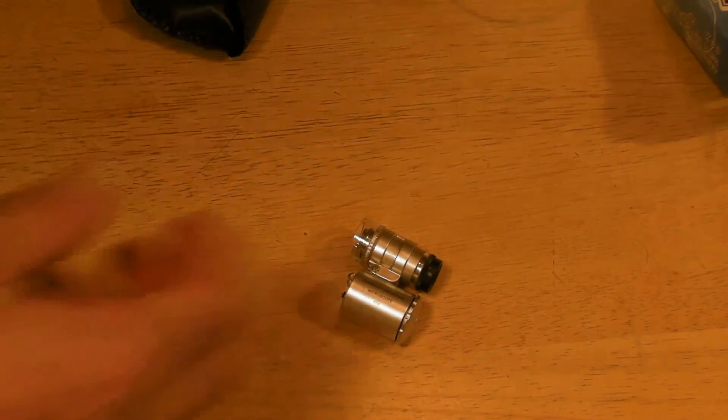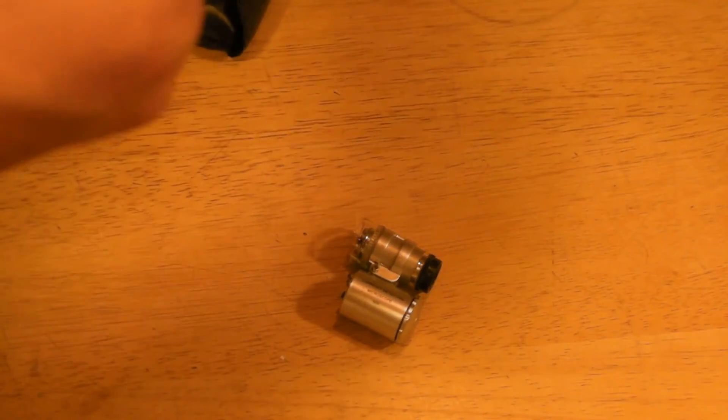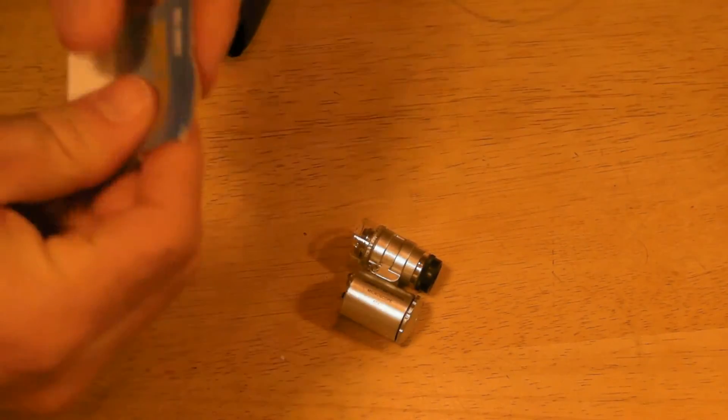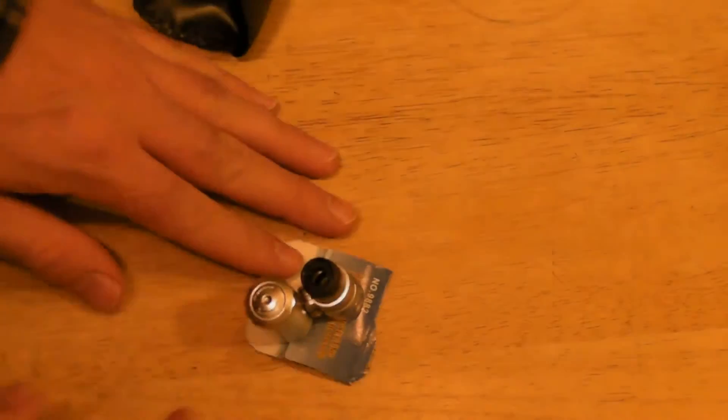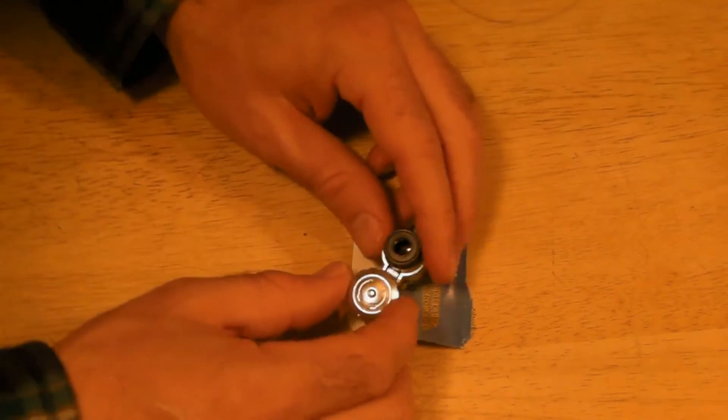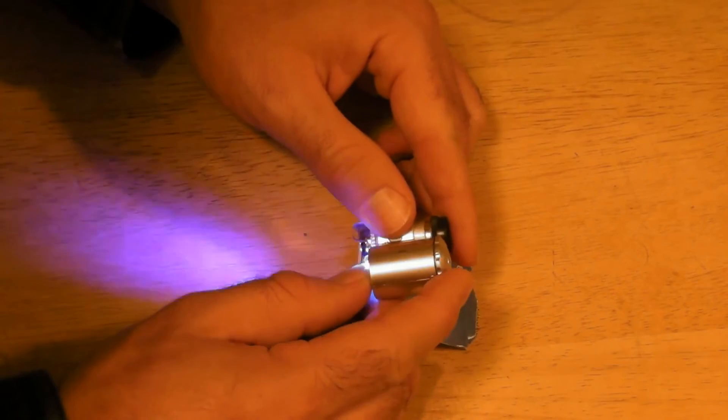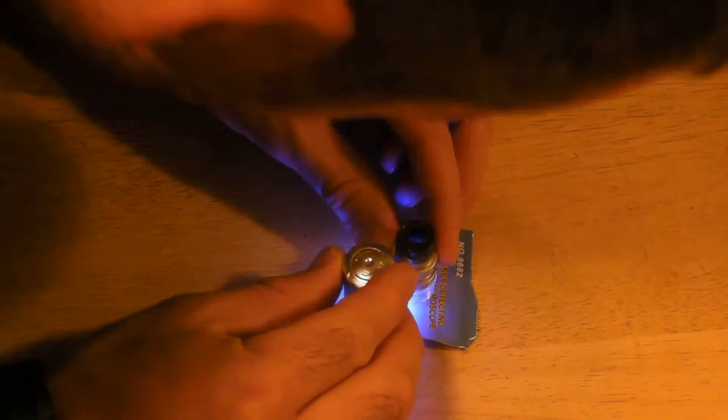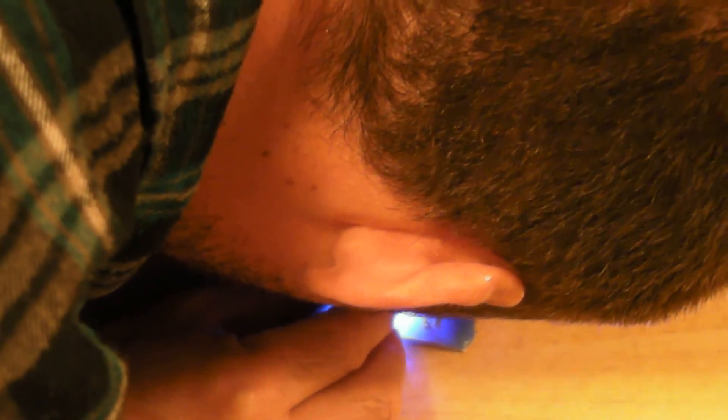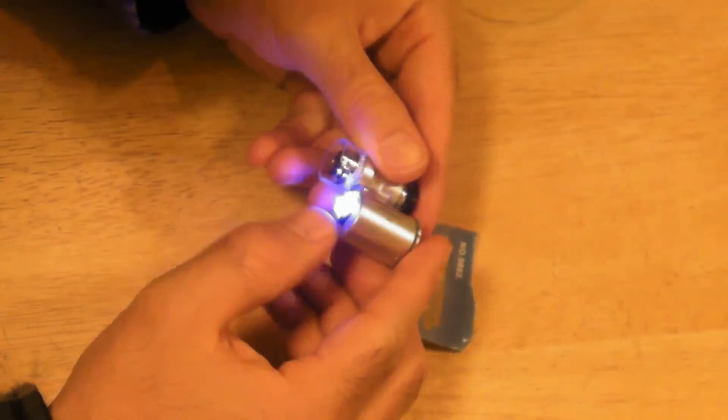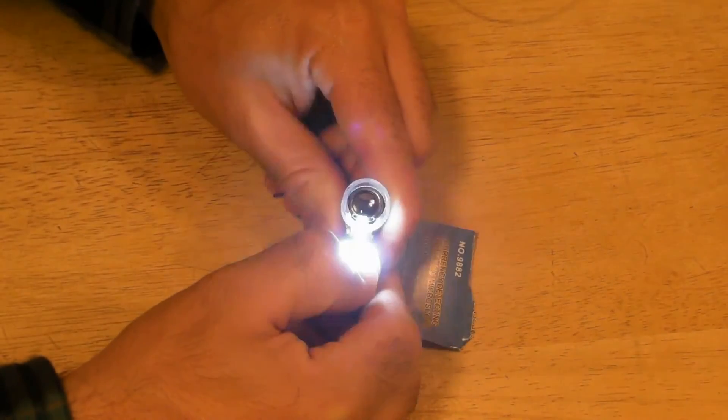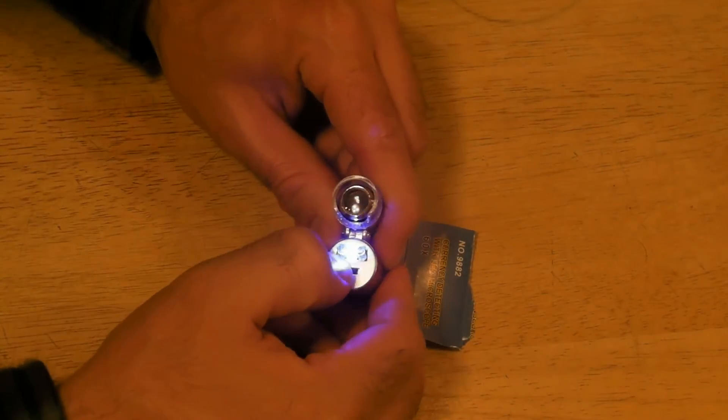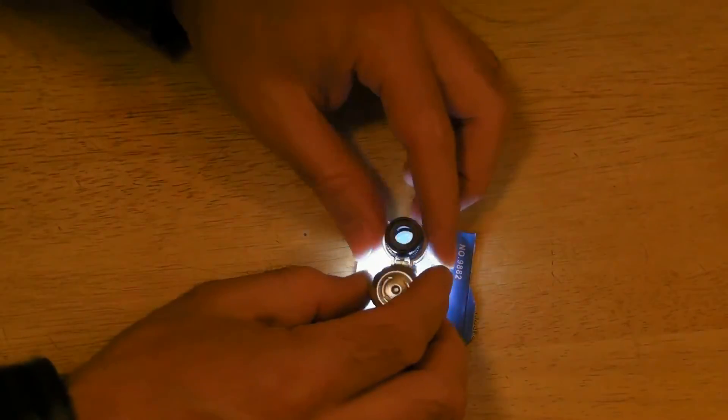Okay so I'm just going to take off a little piece of this box. Get the lens down here. And I'm going to turn on the light. And I'm just going to look. And I can see the little pixelation. Let's see if I can get it brighter. Alright there we go. So we have the UV light and then we have the other light.